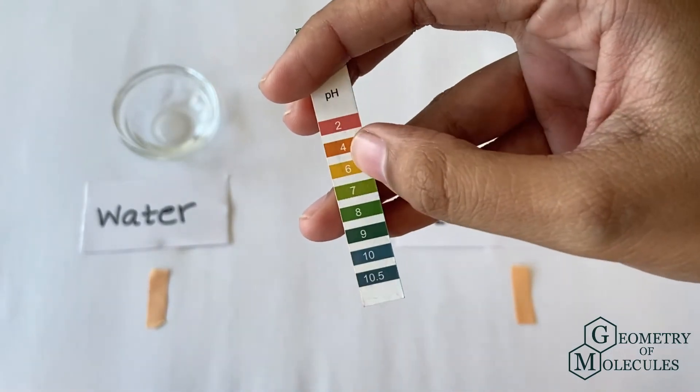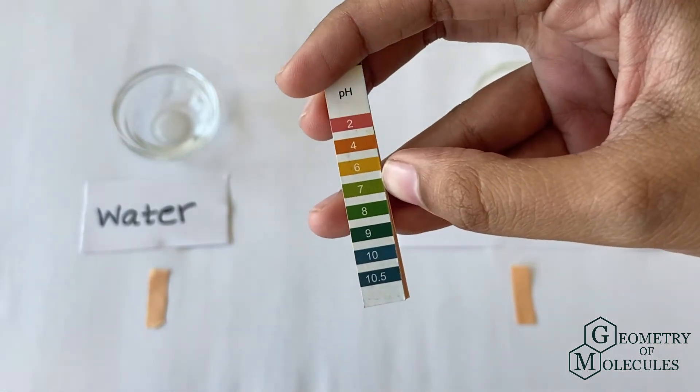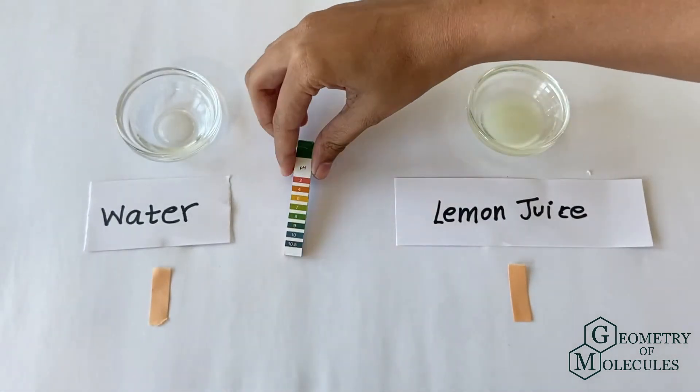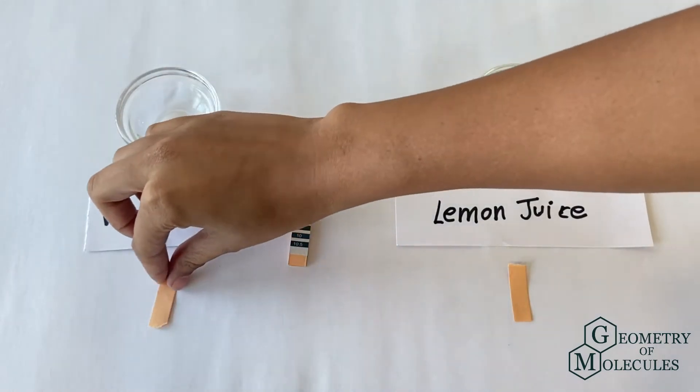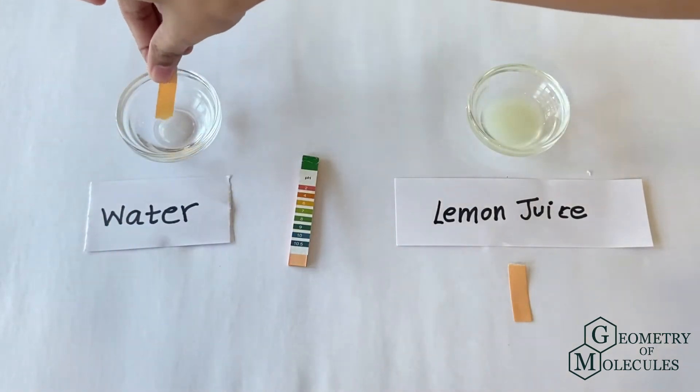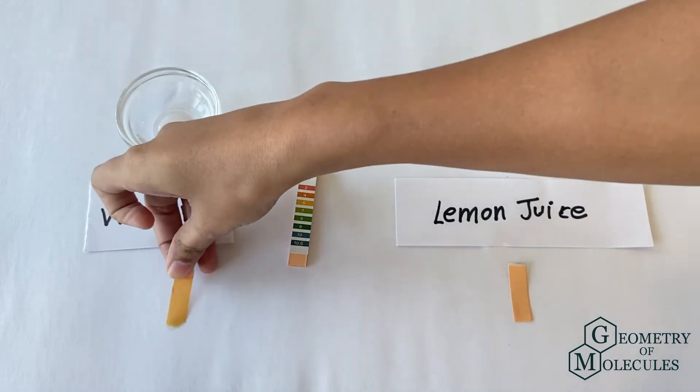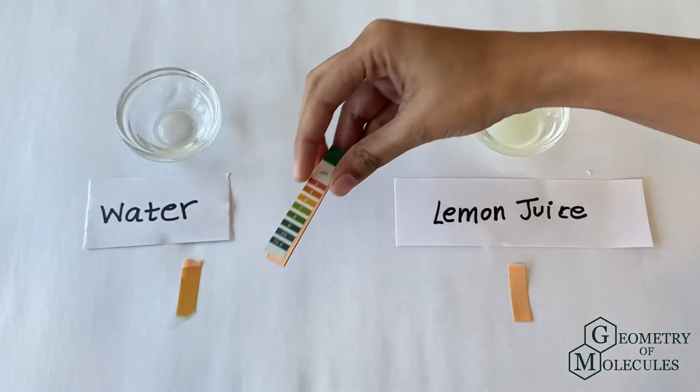If you get the value of 7, that means that our substance is neutral. Now let us test that by dipping our pH strip in water. We know that water is neutral, and as shown in this guide, the pH strip should change its color to light green.